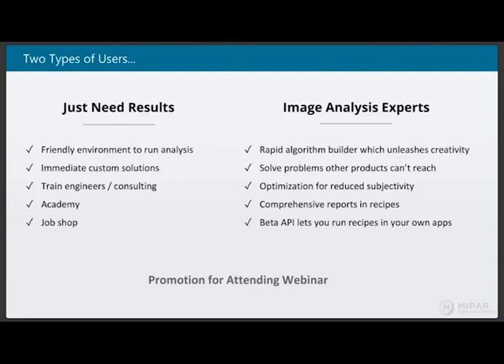As you are thinking and creating and experimenting and coming up with an algorithm, MIPAR is just listening to you and recording what you do, and you never have to worry about undoing any of your work. You make a change at any point, everything just updates. Before you know it, you've made your algorithm and, by the way, recorded a macro at the same time without even realizing it. So our users are able to put together some pretty incredible solutions, ones that we never envisioned the software capable of without adding a single line of code or running a single plugin.